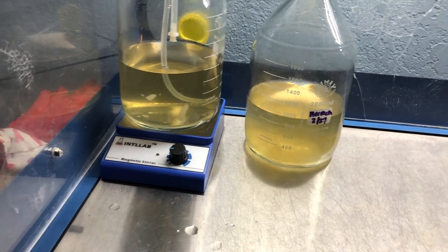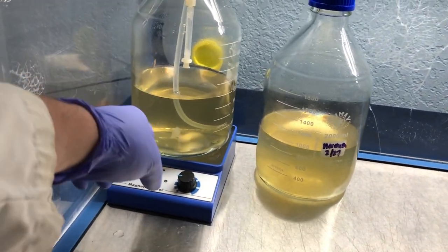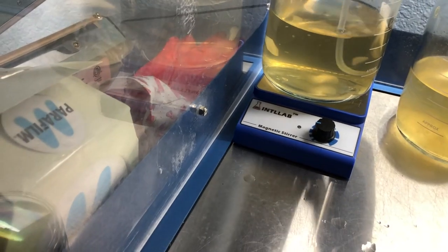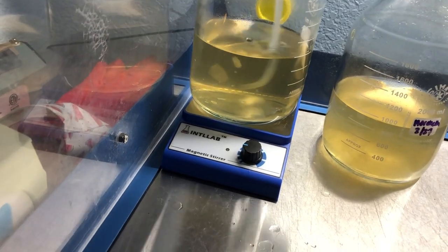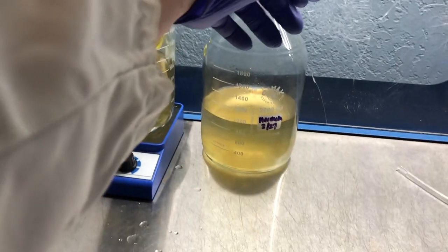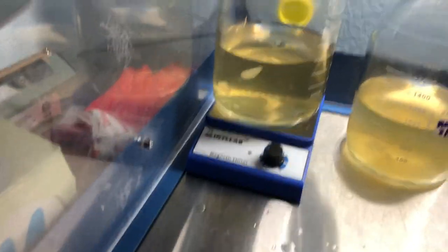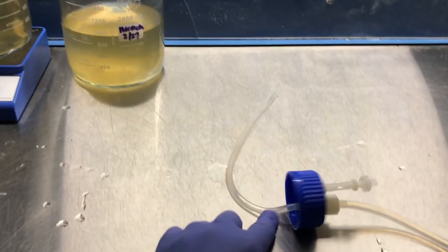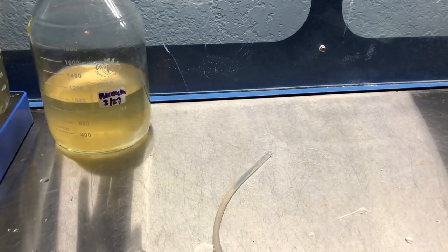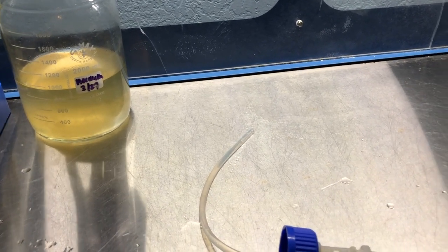So I'm going to go ahead and take this off here, and I'll just replace with a sterile cap, and I'll let that keep on incubating. So then I'm going to sterilize this guy one more time, and then we're going to inoculate a bunch of spawn and dilute out some of this mycelium using the media extractor.